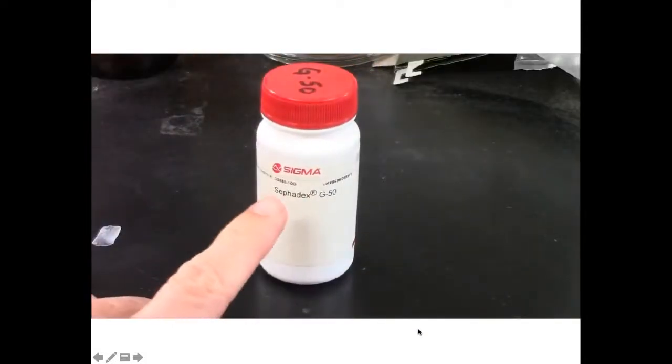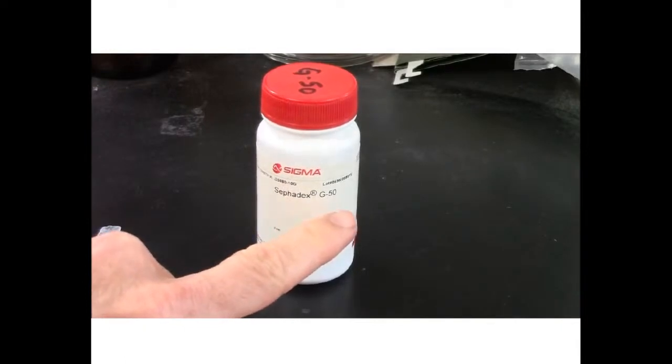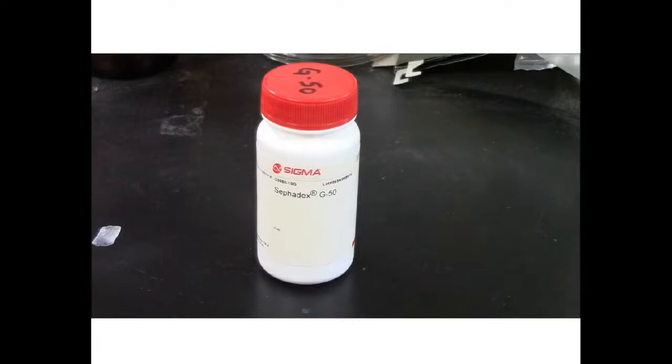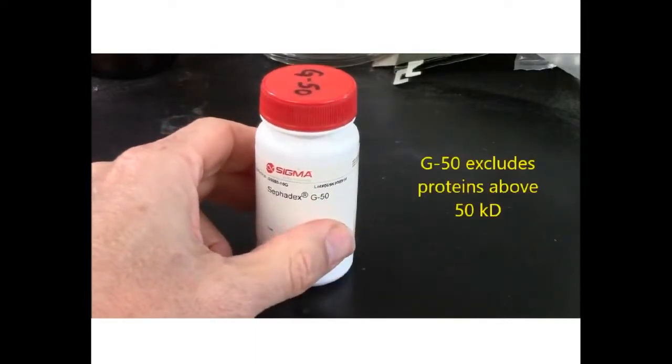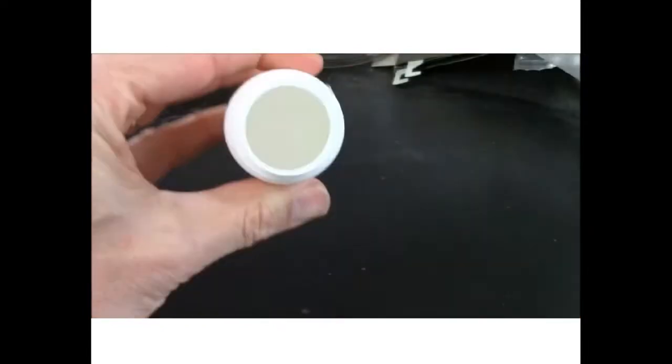We're starting with gel filtration medium. This is Sephadex G50. The number here gives you an approximation of the size exclusion, so this will exclude proteins above 50 kilodaltons, 50,000 molecular weight. Inside is a white powder.